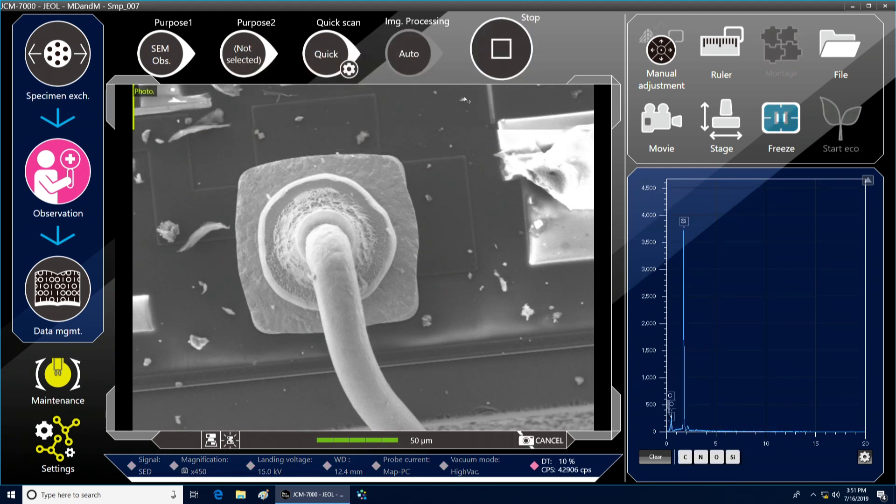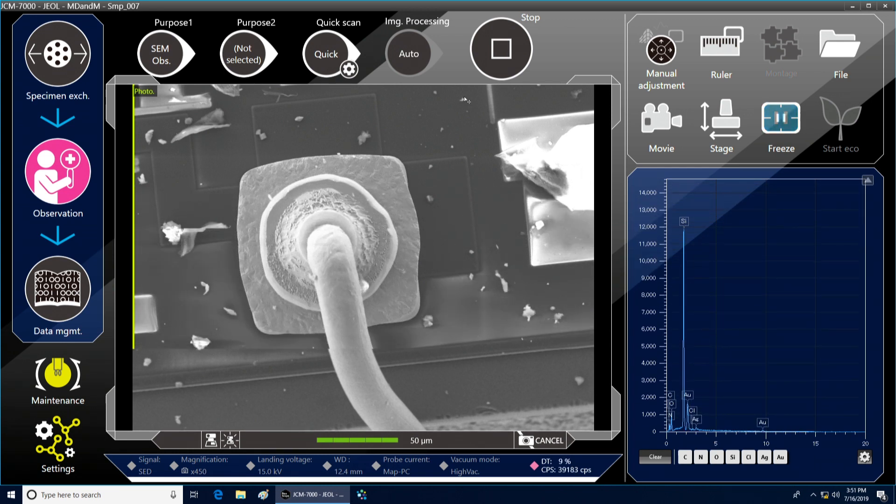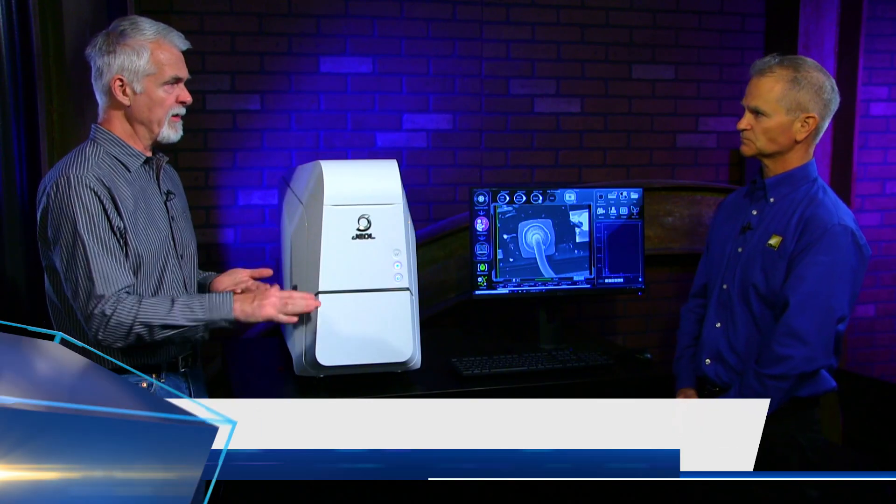Once I got there, you just click the photo button and then you get your full scan and your image is captured.